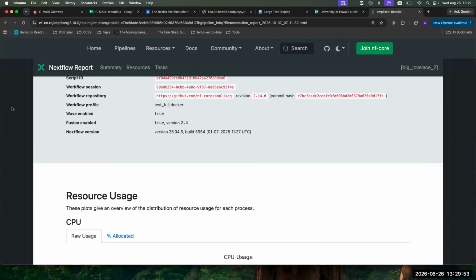And that's frustrating because, frankly, even in our gateway, there's 20 parameters you have to tweak. And in a typical pipeline, there's 150 that you have to tweak. So yeah, I hear your pain. But usually the defaults are fine, depending on what you're doing.